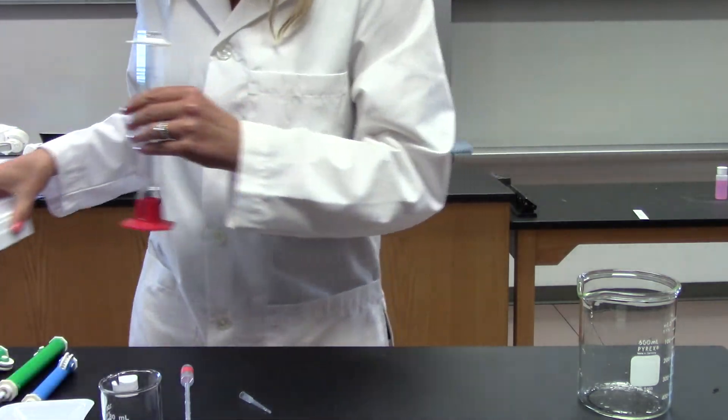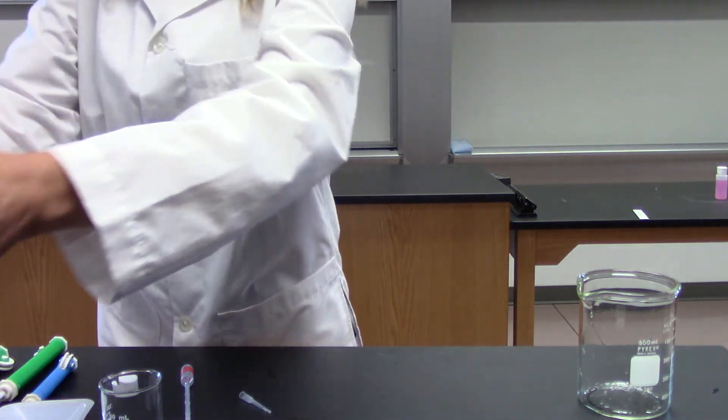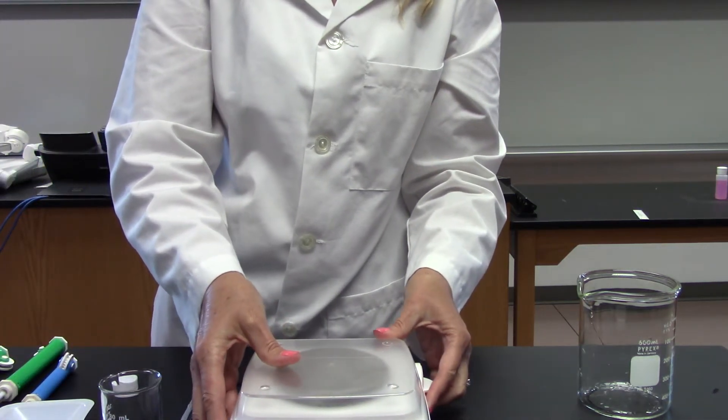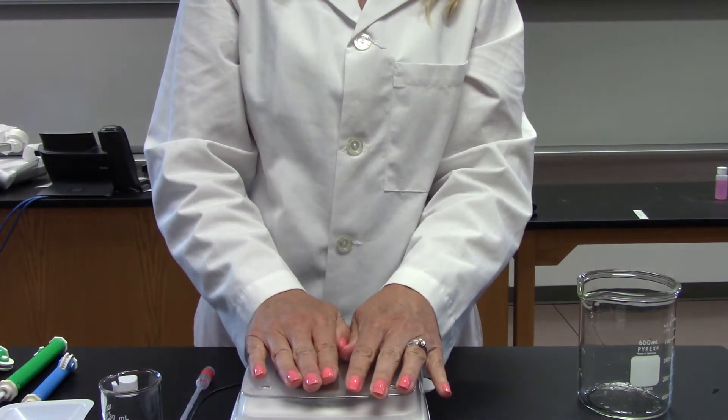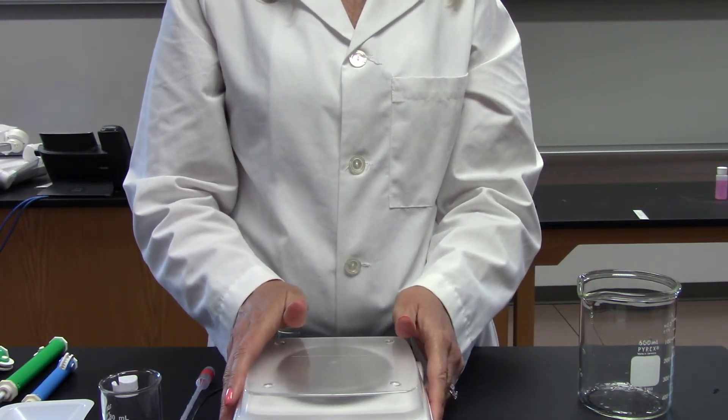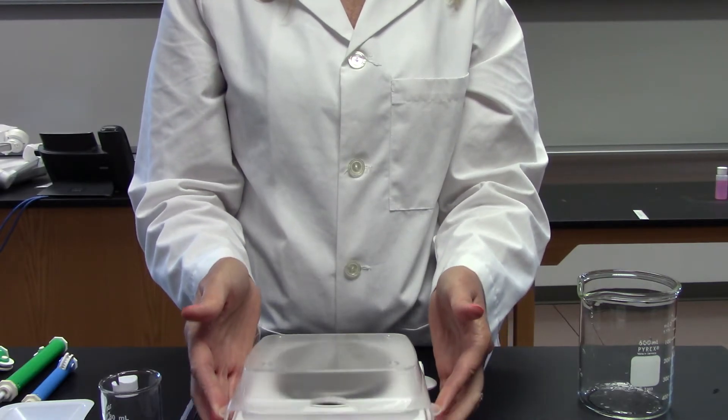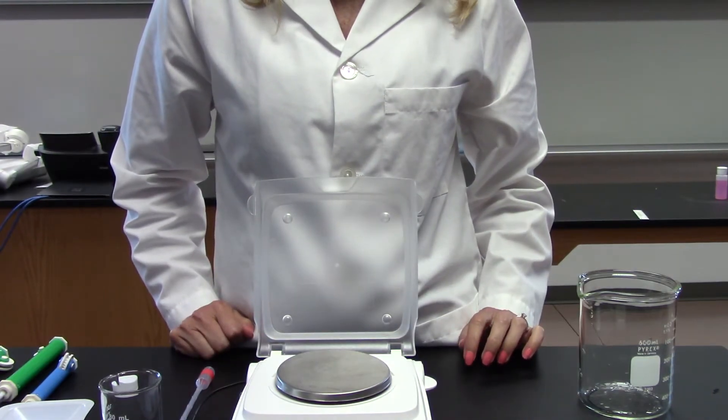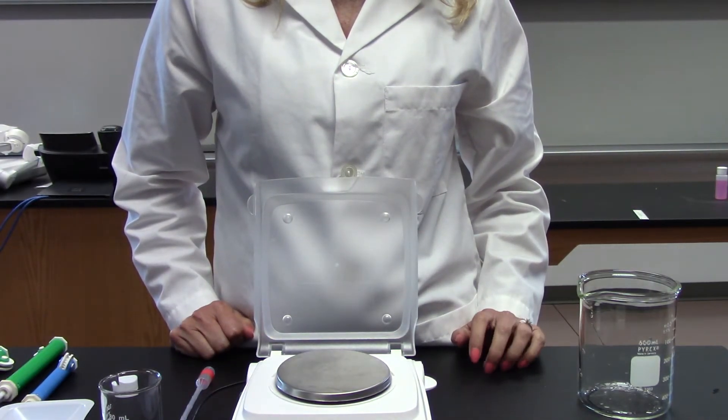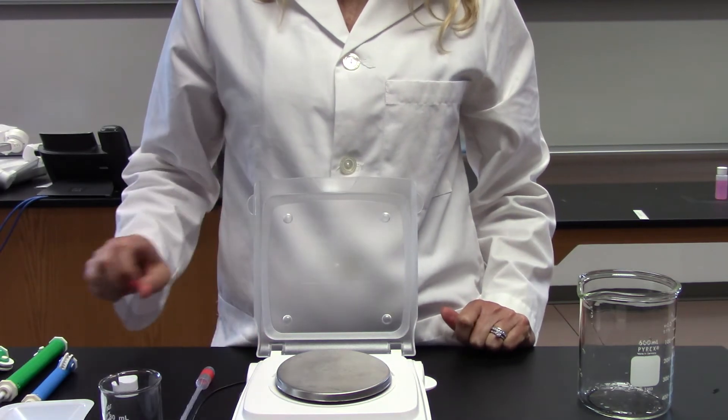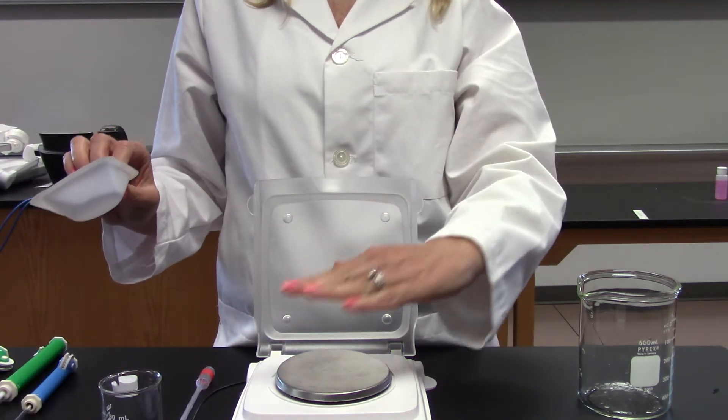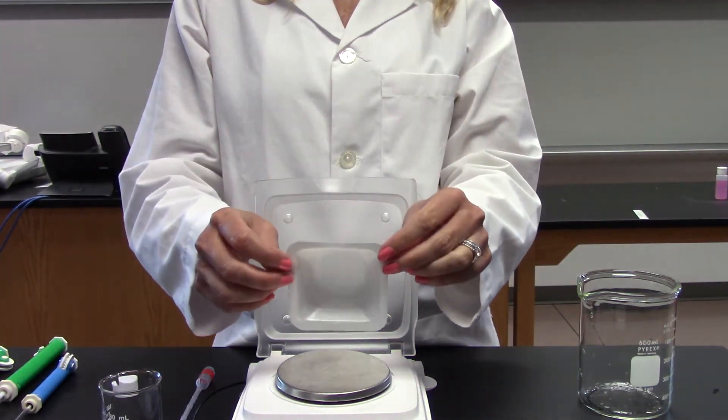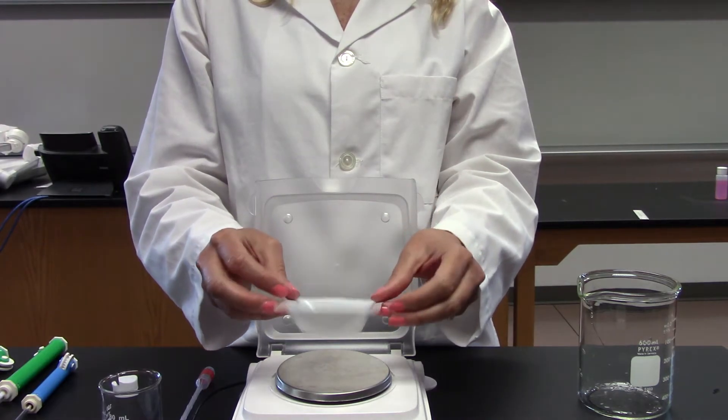For weight or mass, we use a scale or a balance in the lab. This one is pretty simple to use. You always want to make sure you lift the lid - oftentimes a student will say the scale's not working right, and it's because the lid is closed. So you want to open the lid, make sure the power is on, and make sure when the power is on that it says grams, because that's what we're measuring in. You also don't ever want to put anything directly on the scale. You'll always want to use something like a weighing boat or some other type of container.